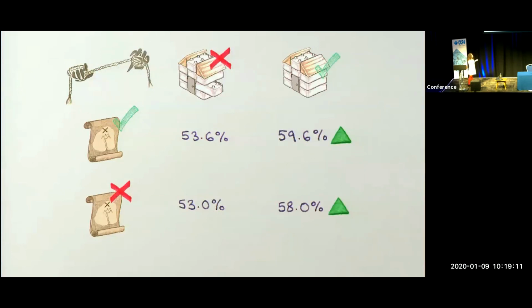And you can see that this is consistent with the fact that the input model isn't biasing this as much, and it's also consistent with the reduction in the gap between R work and R free that indicates a reduction in the level of overfitting in this scenario. So that's an example where I feel like Vagabond is clearly making this difference in the level of overfitting.